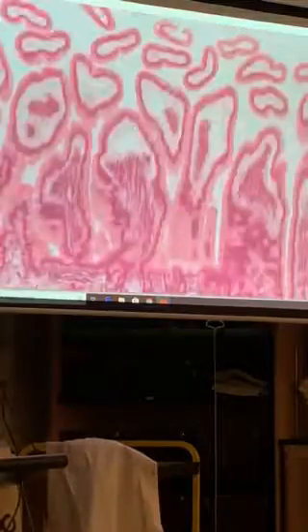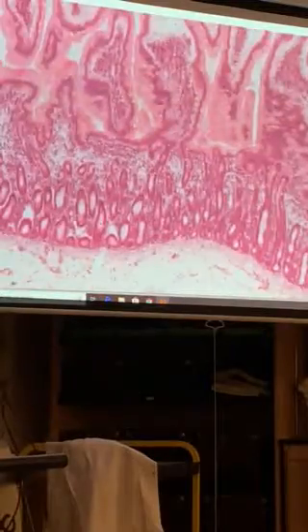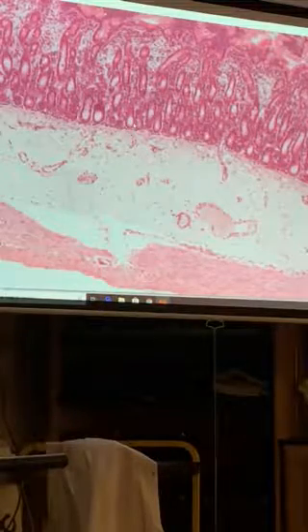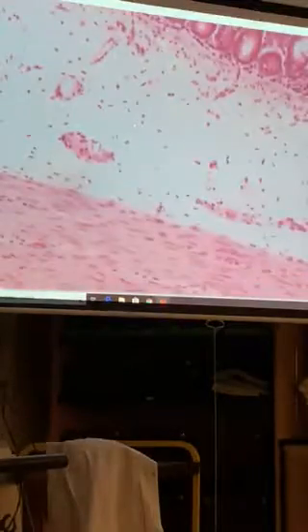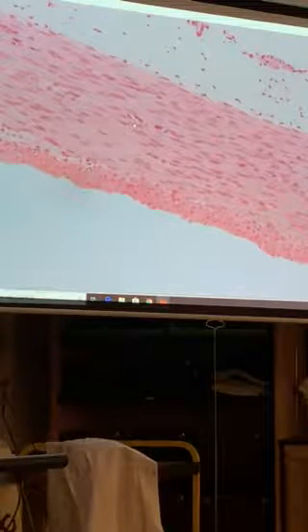All right, so we see something that should be a telltale sign up here at this end of the organ for you, and then we are going deeper. Let's zoom in. A couple of capillaries, a little venule, a little arteriole, so those are just, you might see those here and there, but nothing really noteworthy here. Okay, keep going. All right, so we're gonna name that organ.